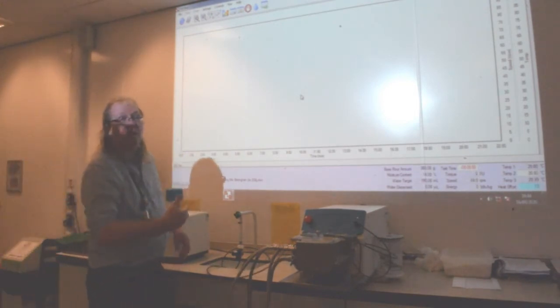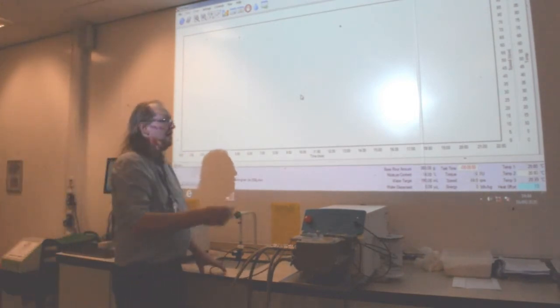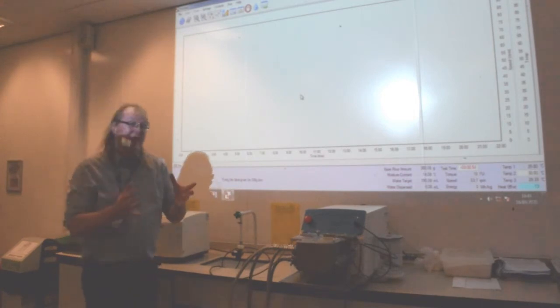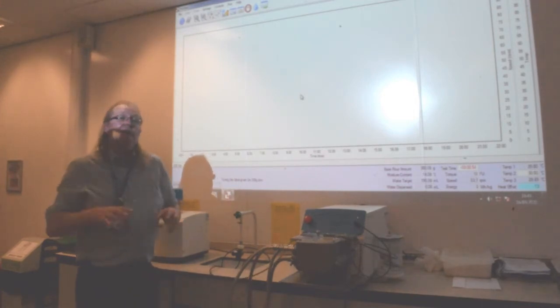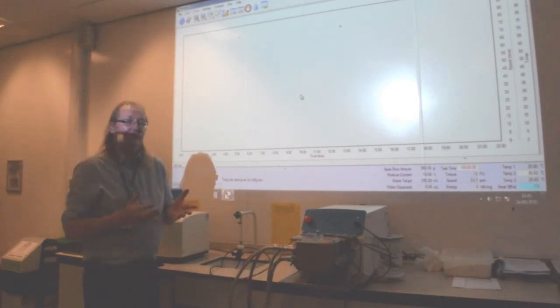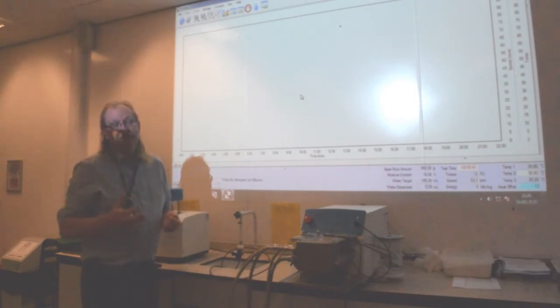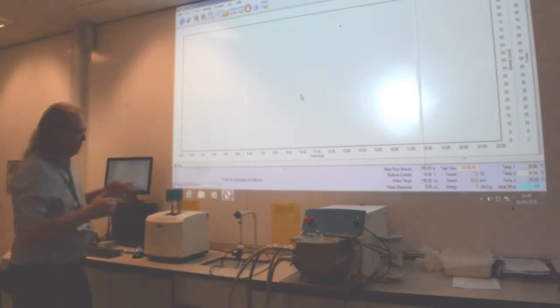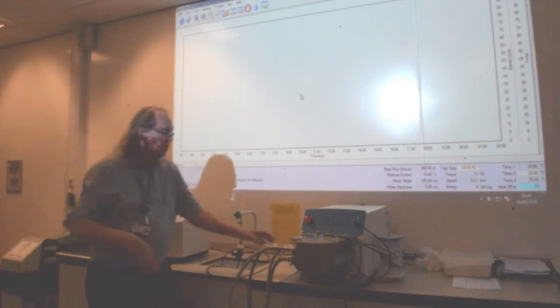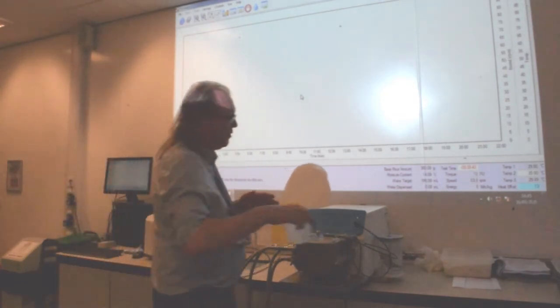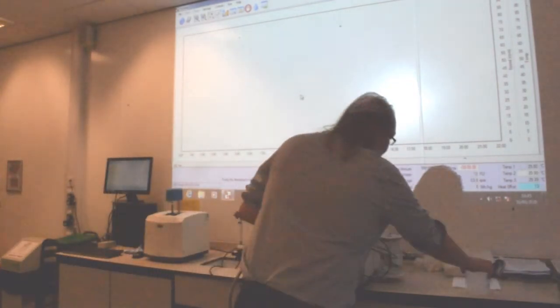It's going to mix for about a minute without any water. This is to stabilize the temperature of the particular sample. So while it's doing that, you can just have a tidy up, make sure everything's out of the way.